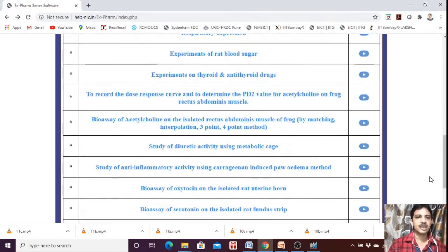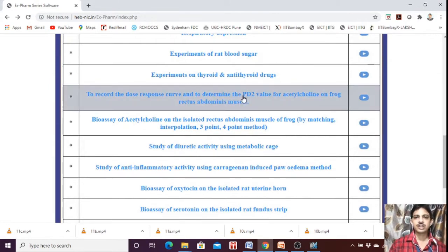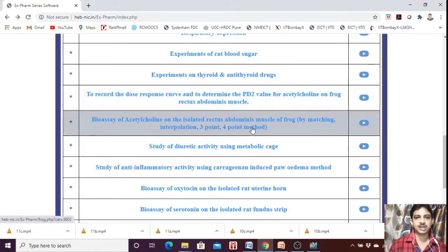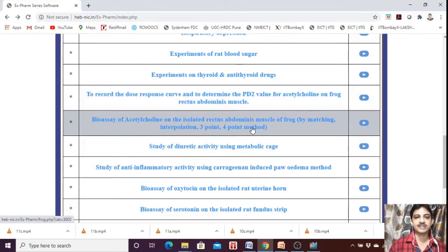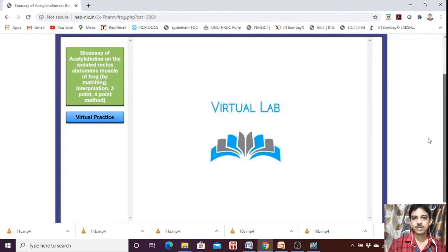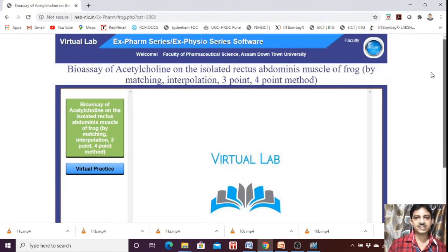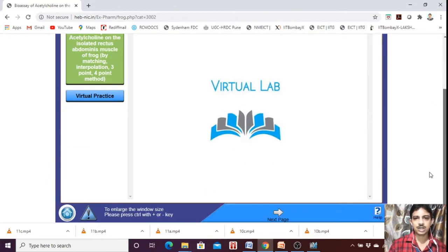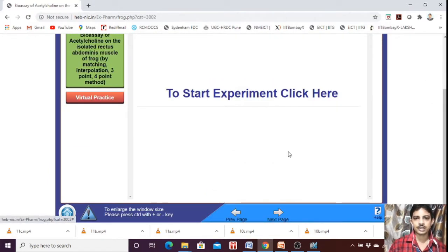For this, there is no separate experiment. You need to click on bioassay — just click on bioassay in the virtual lab software.